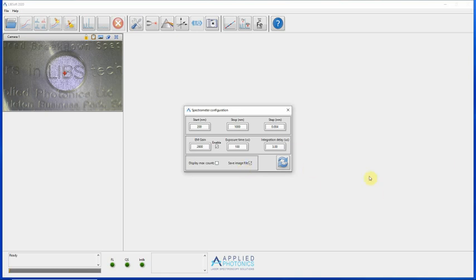If the Save Image File box is checked, then the image data acquired by the spectrometer is saved alongside the spectrum file. Kestrel spec can be used separately to reprocess the data in this image file if required. However, this is not usually necessary. Refer to the Kestrel spec manual for details.